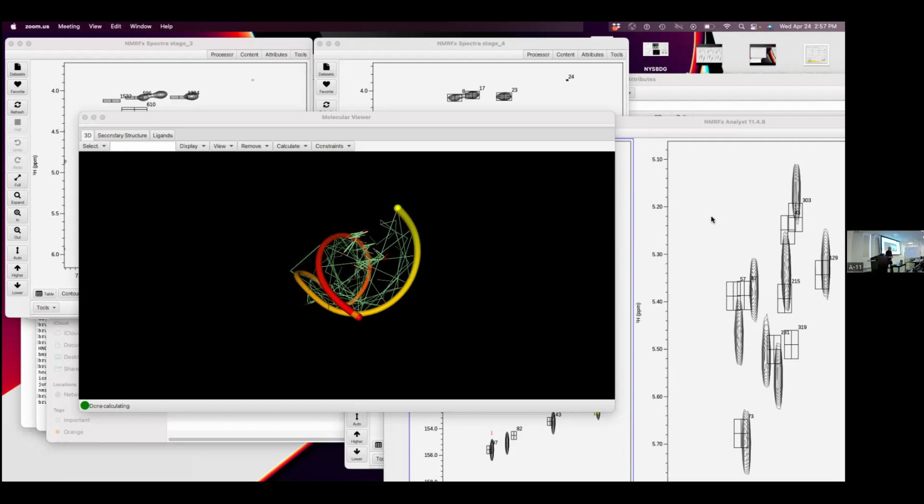There's no longer a header section in the ser file. Varian files have a header. I don't think Bruker ser files do, because I used to read them without paying any attention to the acqus.